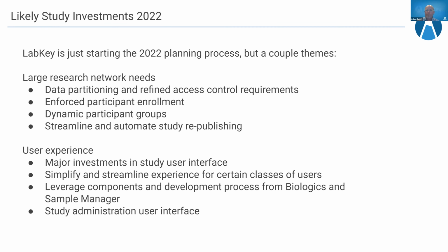Another big area of investment is going to be user interface. We have learned a lot over the last few years from developing Biologics and Sample Manager, and we want to apply a lot of those learnings to LabKey Study to make that user interface, to borrow a lot of the technology, but also the best practices and the design principles that we've learned for our other products, and really make Study a much more usable system, especially for casual end users. Maybe they don't use LabKey on a day-to-day basis, but we want them to get more value out of the system through these user interface improvements.